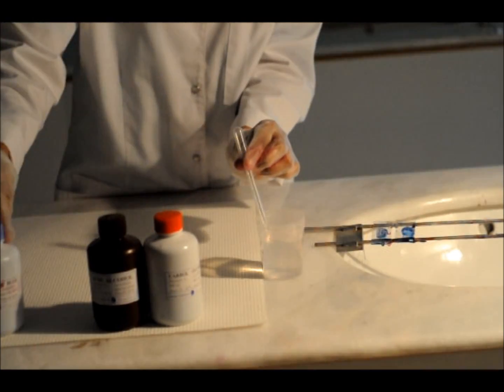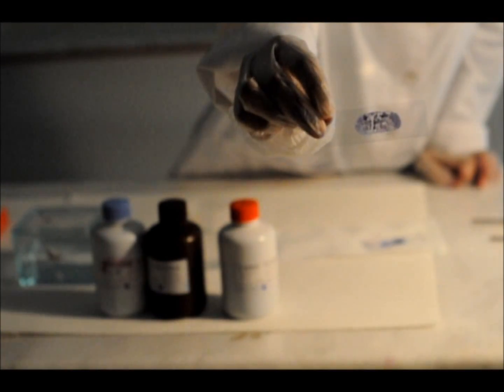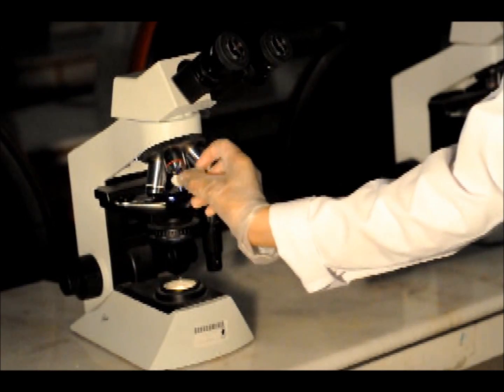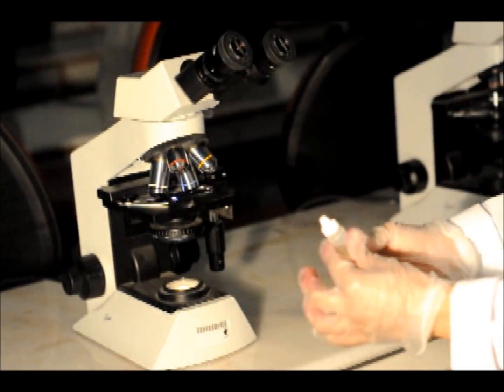Rinse in tap water again and let it air dry. Then examine it under the microscope.